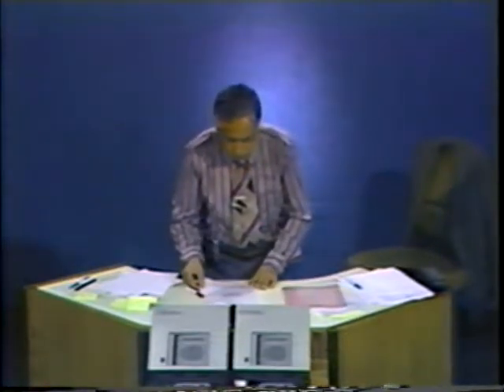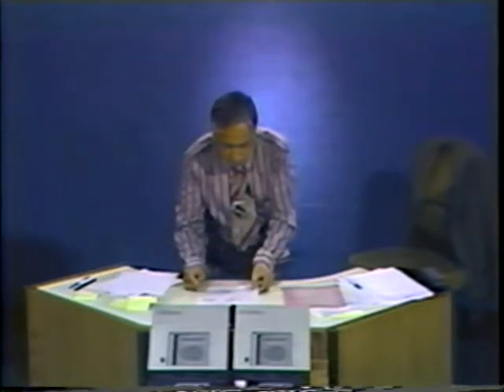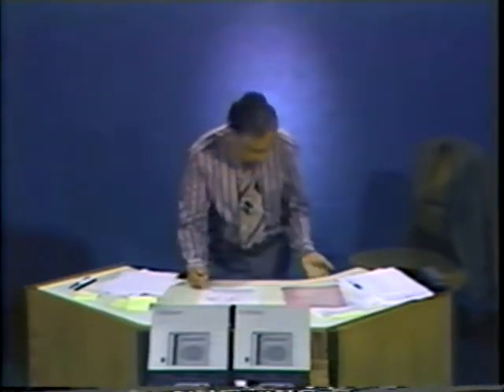This is further exemplified in this picture, where this lower one is an absolute intensity plot, and you see the cross peak has some structure.